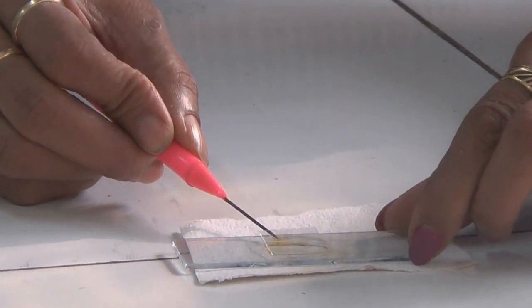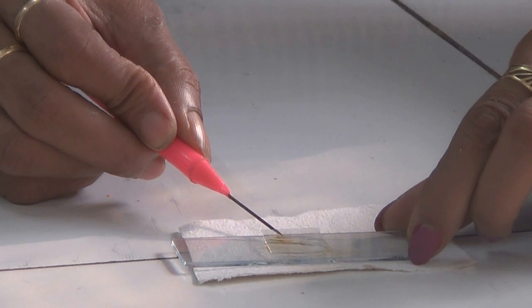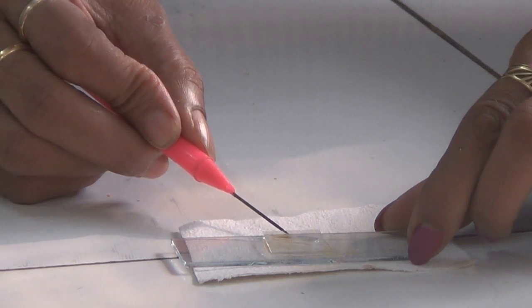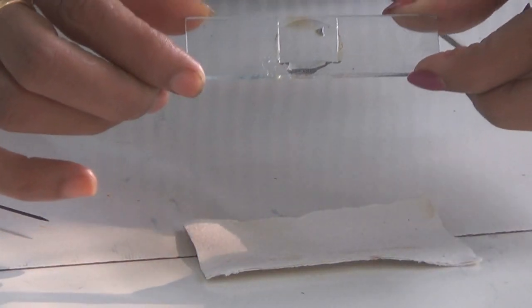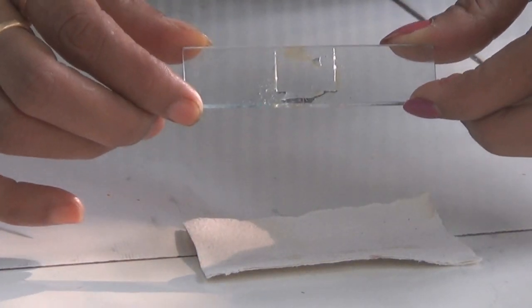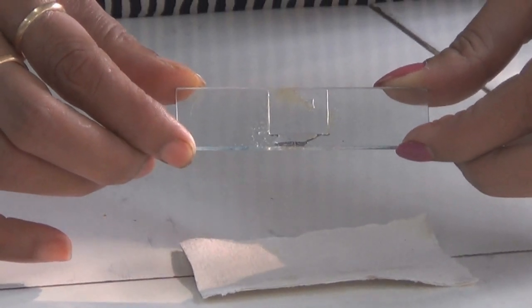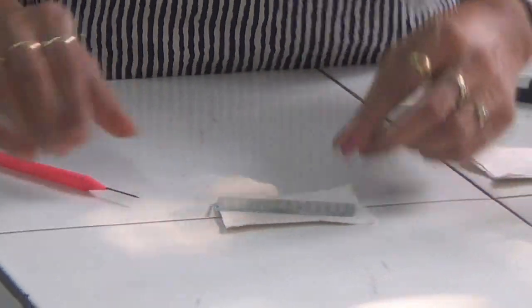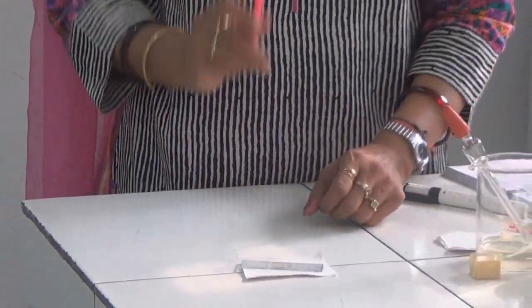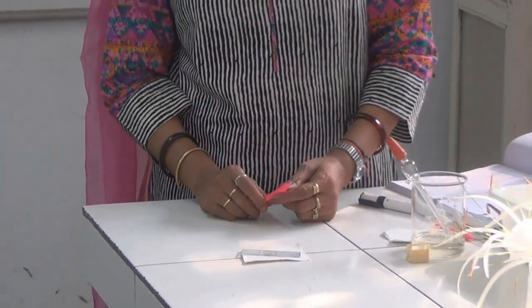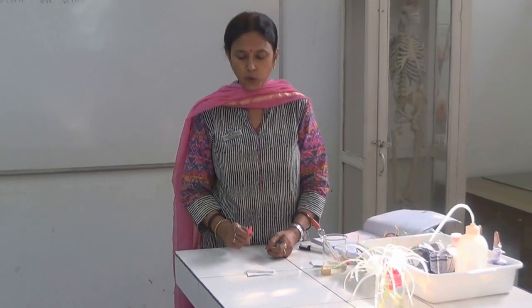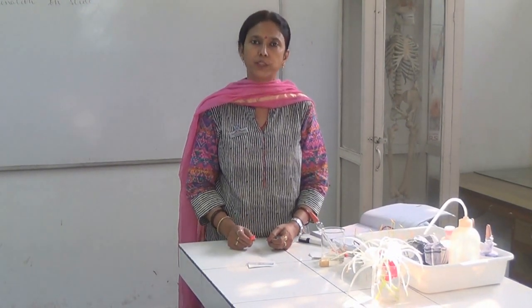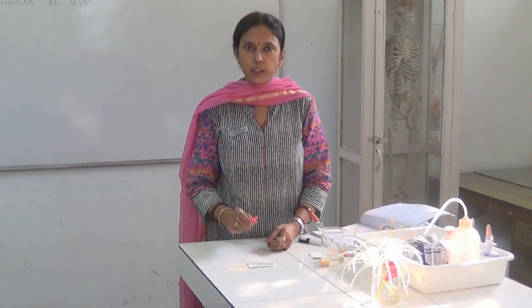Use a needle when placing the cover slip and slowly remove the needle so that there is no air bubble. This slide is to be kept aside for about half an hour before you observe the germination of pollen grains. You cannot see all the pollens germinating because the pollens have germ pores through which the pollen tubes arise. If the pollen is placed in a proper manner on the slide, only then the germination of that pollen can be observed.